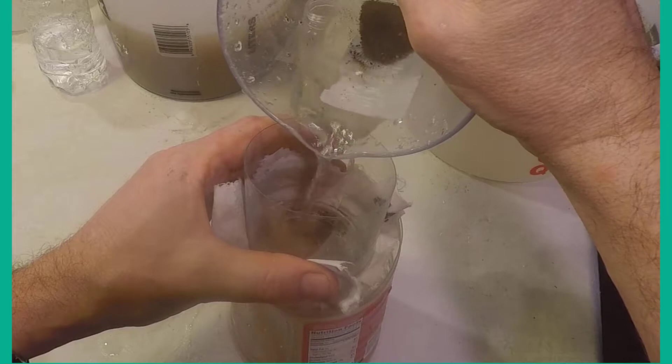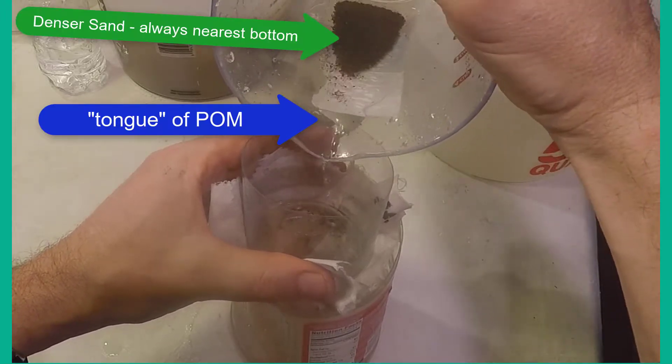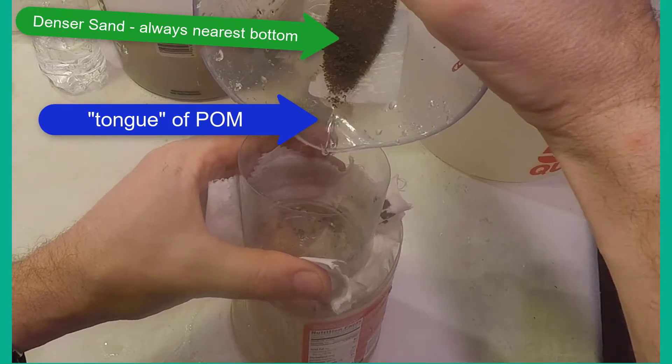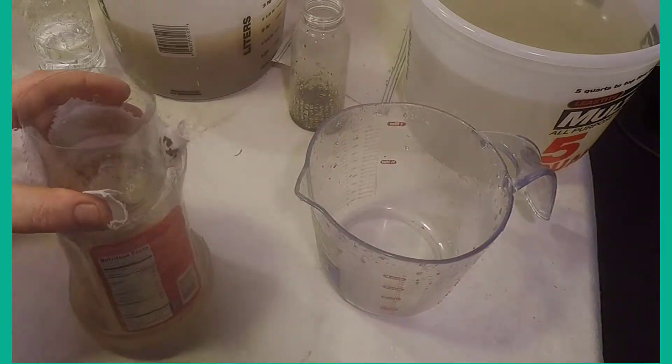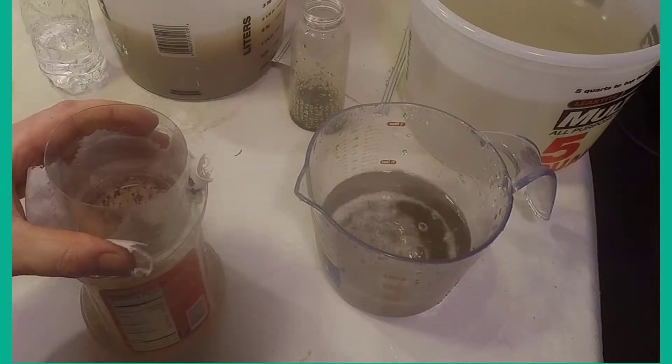You'll notice with successive repeats of decanting that the organic matter forms a small tongue that advances ahead of the denser sand at the bottom of the container.